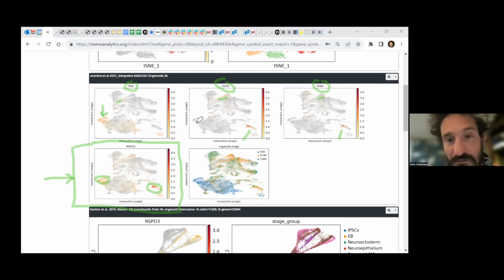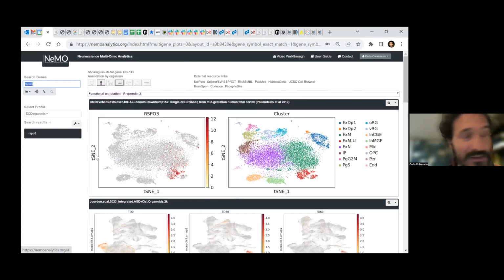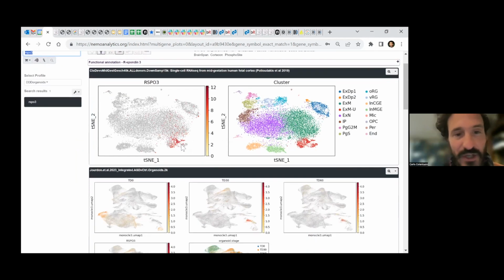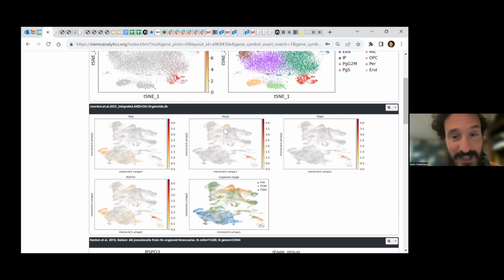And so the way this website works in general is like this. You can ask for a particular gene. You just enter it up in the corner. This is Alex's data, but I've popped up a couple other data sets here. This is an in vivo data set from Poliudakis, and that's the Geschwind lab from 2019. So you can also see here, there's actually this later population. This is in differentiated neurons. So that's kind of a surprise for at least how I was thinking about it in an organizer. But like I said, also in the organoids, there is a neuronal population that starts to express this R-spondin. So I don't know exactly what that is. I don't know if anyone on the call might.